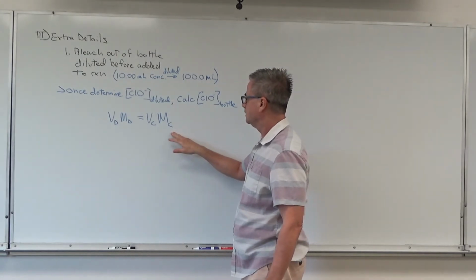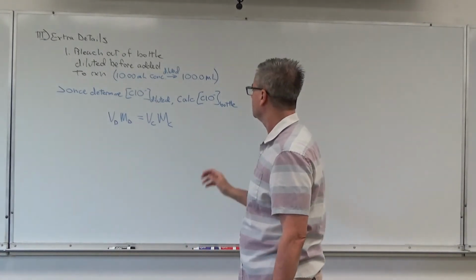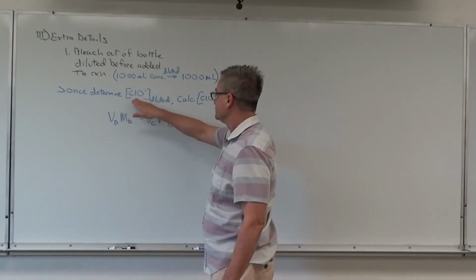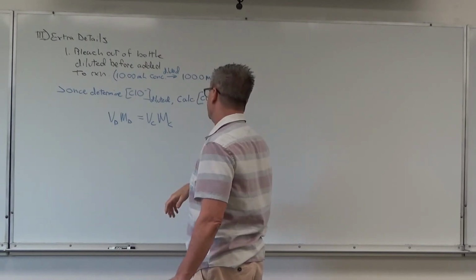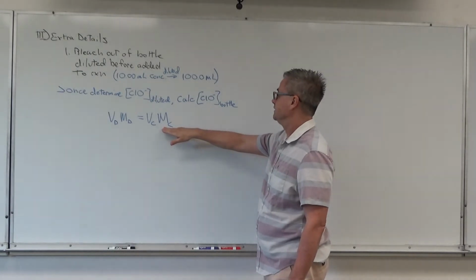As always, I strongly suggest that you rearrange before you plug things in. What we're going to be looking for in the end is the molarity of the concentrated.